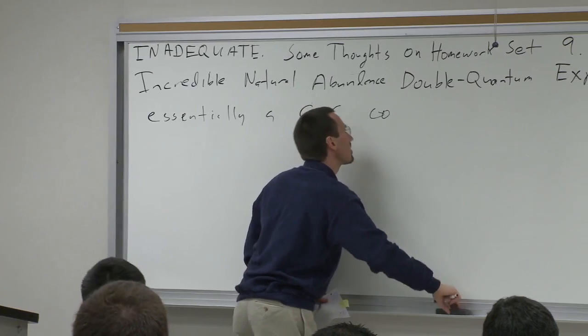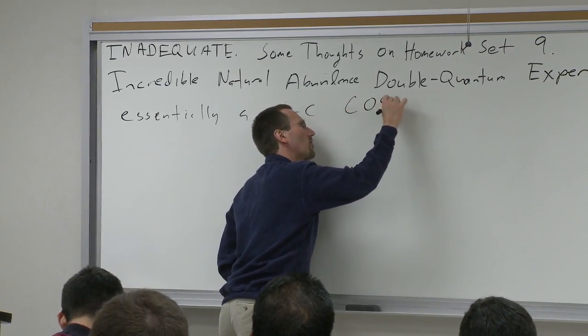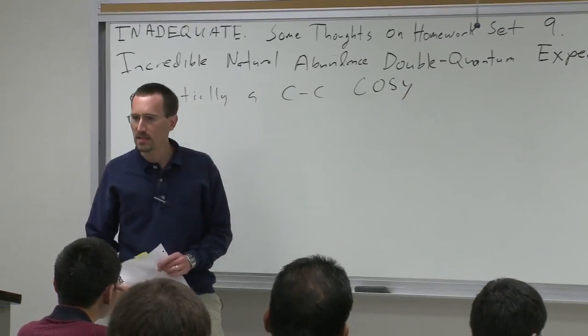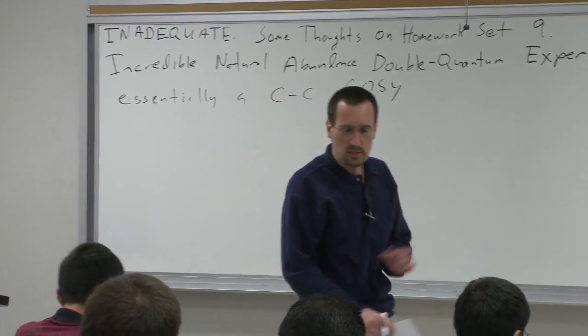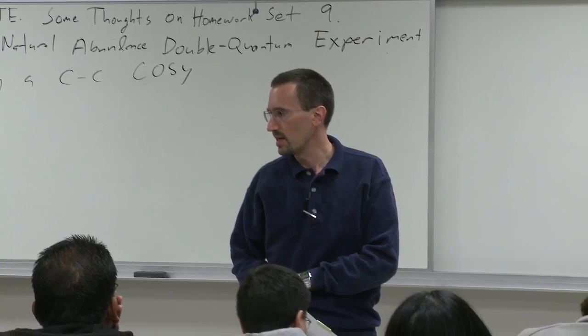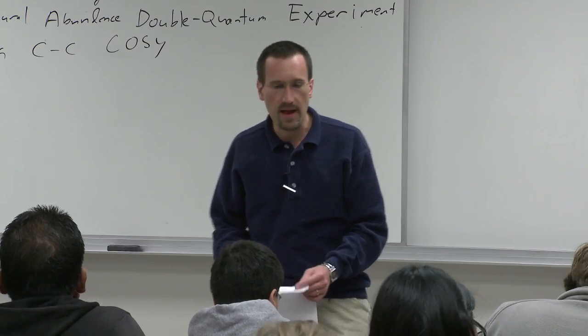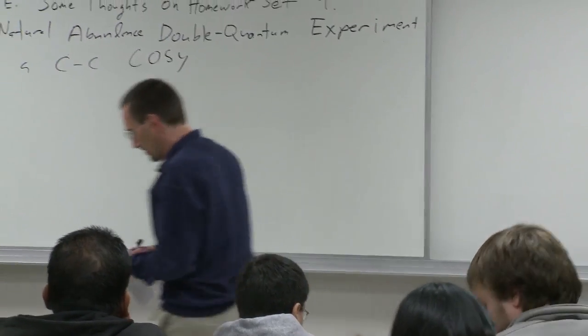And what's so incredibly powerful about this technique is it means that you really can stitch together any carbon skeleton with it. And what's inadequate, of course, about it is the amount of C13.